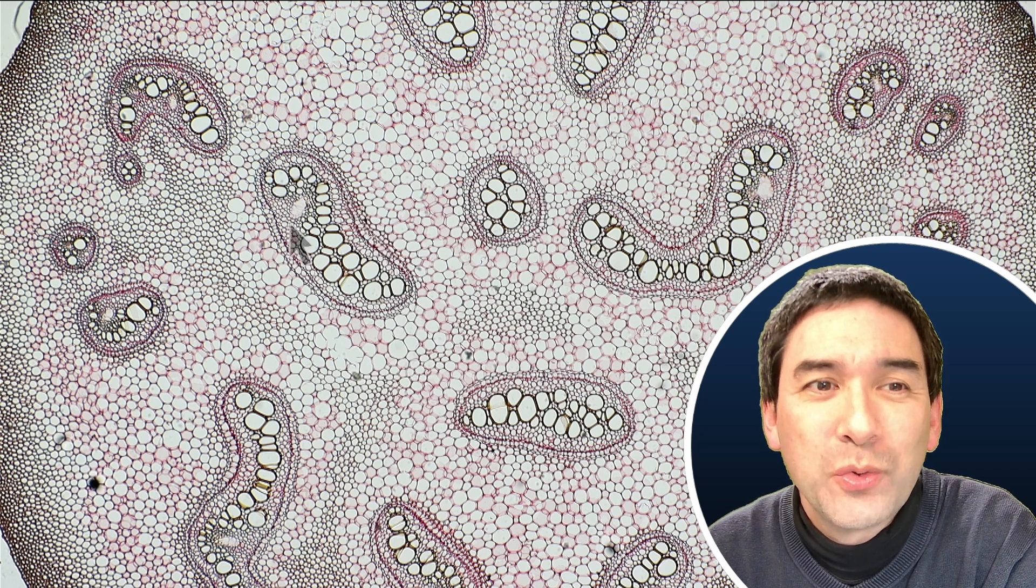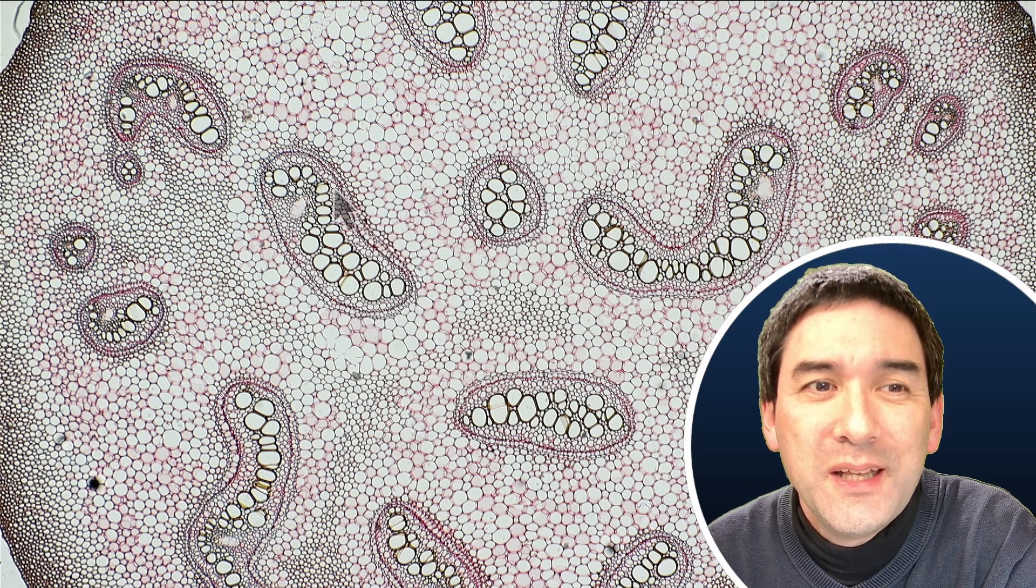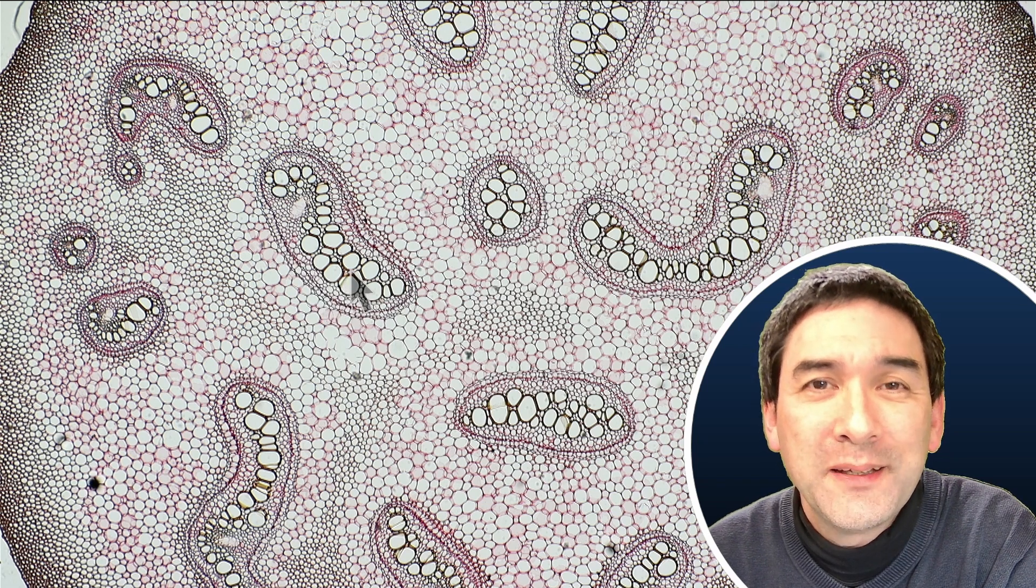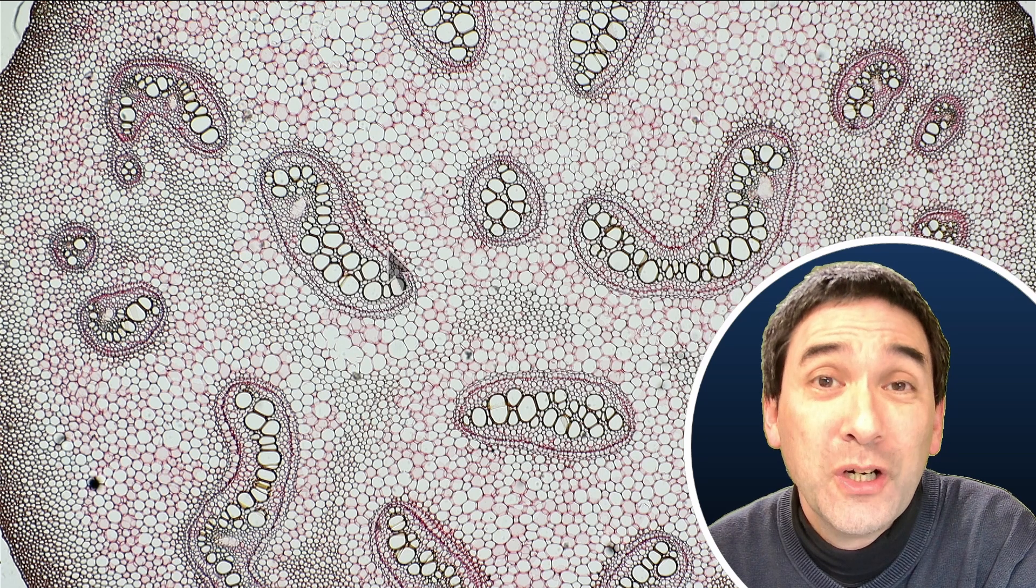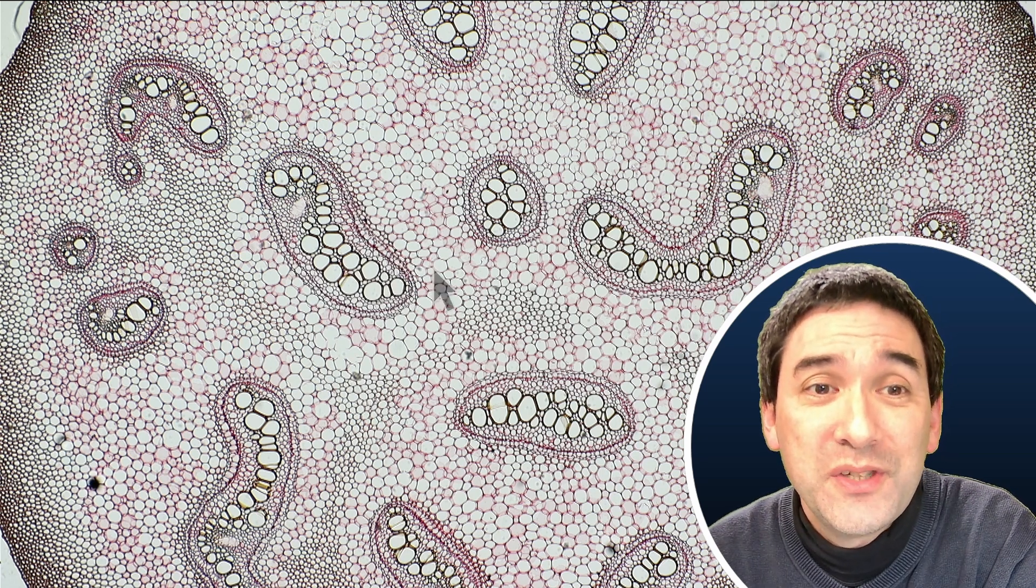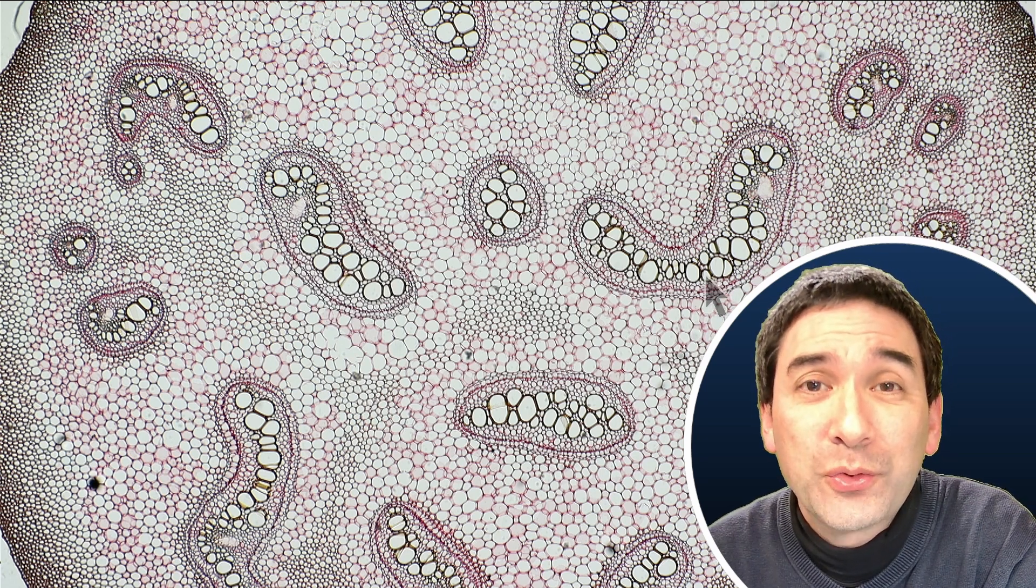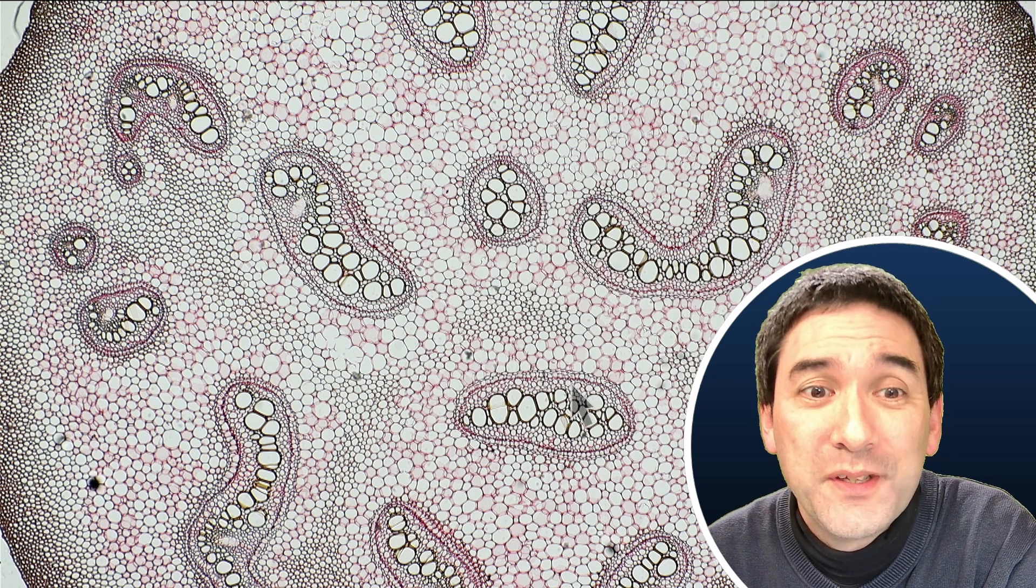What are these? Well, these are the so-called vascular bundles. These are the cells that transport water up the plant and also sap, which contains sugar, down to the roots. So you see that they are scattered throughout the cross section here of the stem.